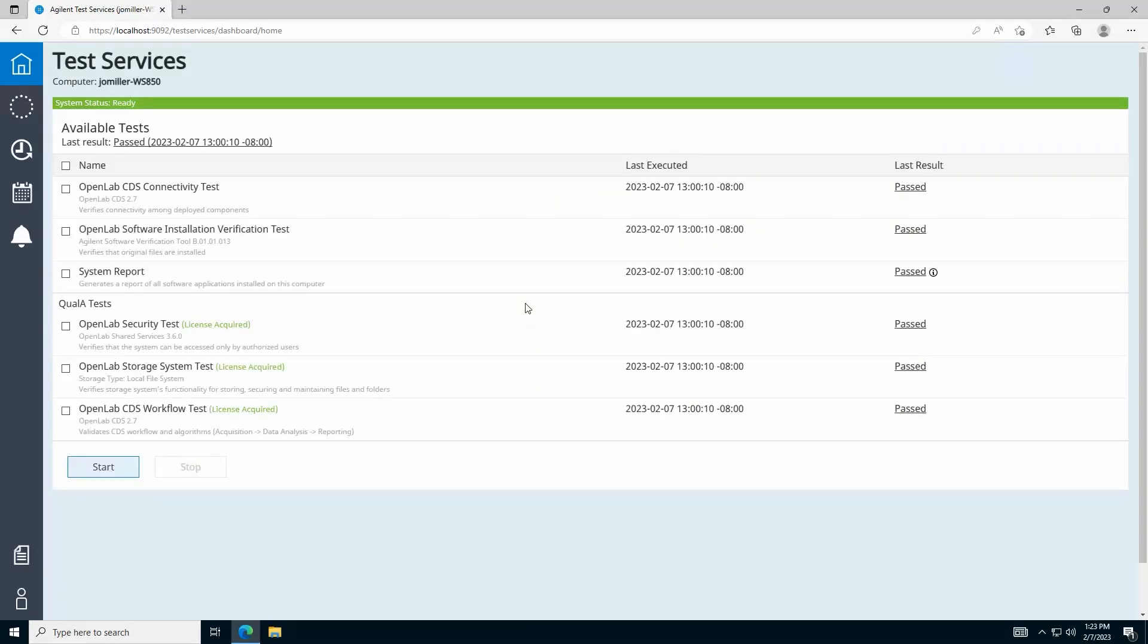Once you've logged in, you'll see the homepage, which shows the computer name of the system you're connected to, the system status, and the last overall test result.